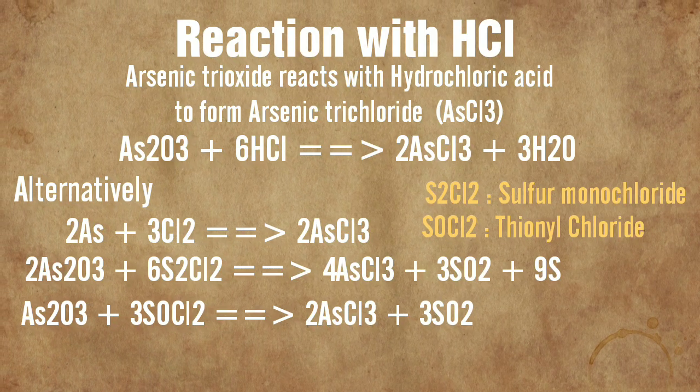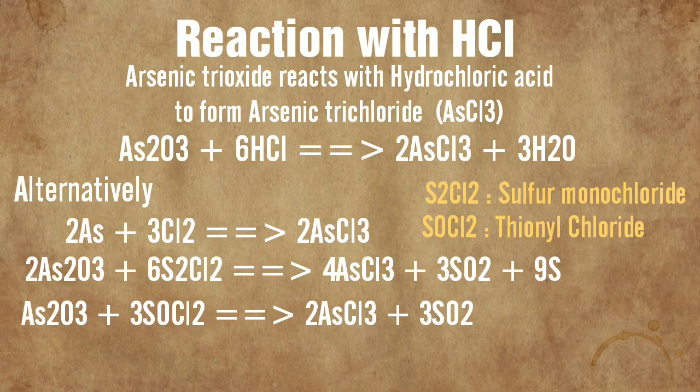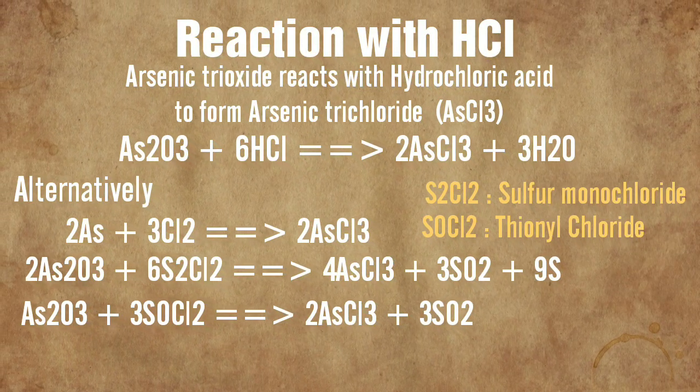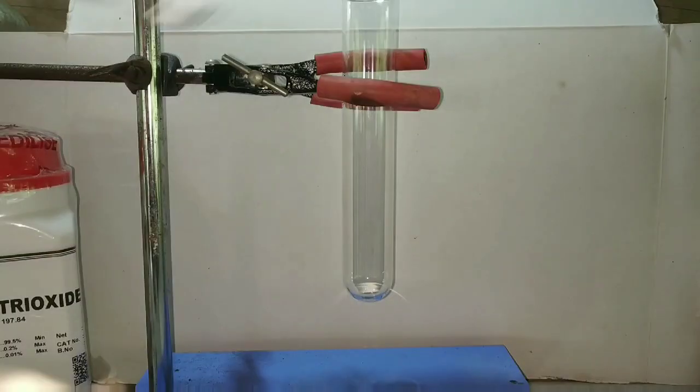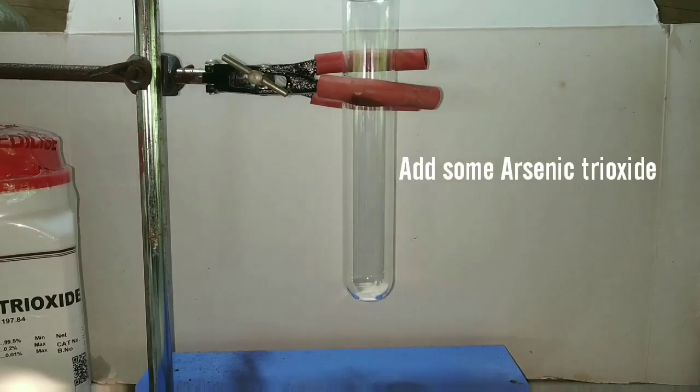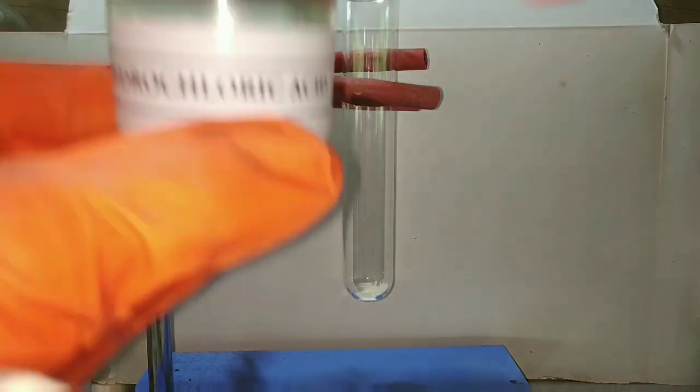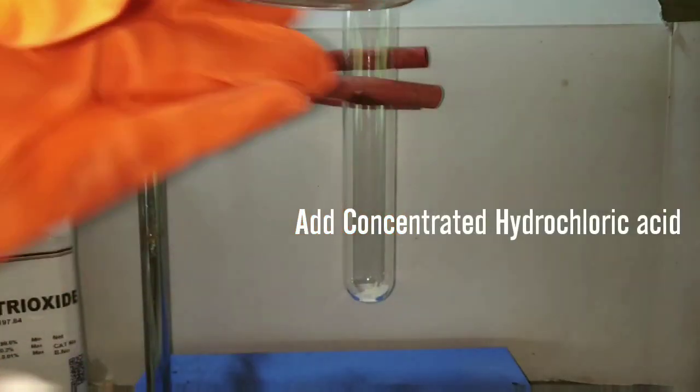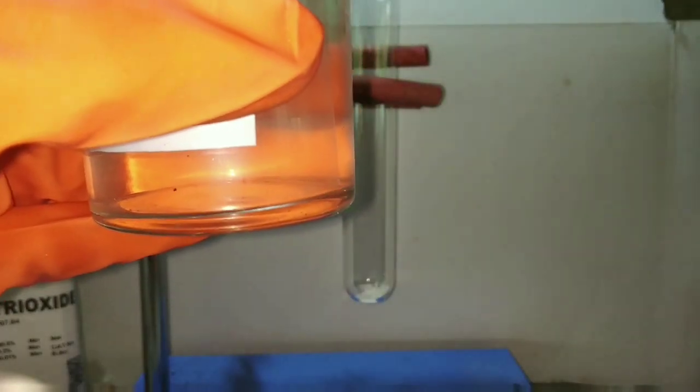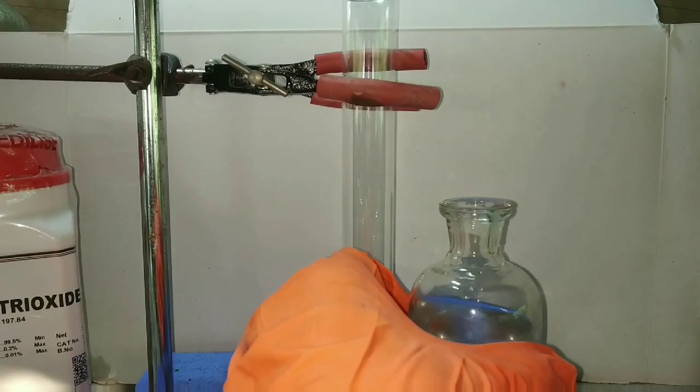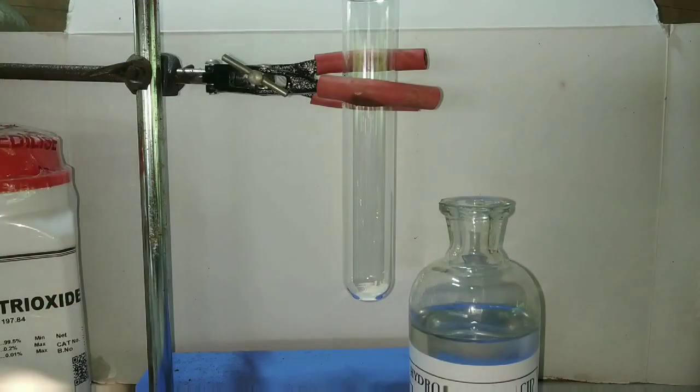Now we will see the reaction of arsenic trioxide with concentrated hydrochloric acid. It forms arsenic trichloride. Alternative methods are given below. First of all we take the compound in the test tube. The next step is to add the concentrated hydrochloric acid. As I always say, we add the concentrated acid with the help of a dropper, not direct addition.